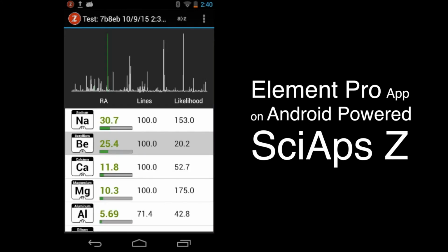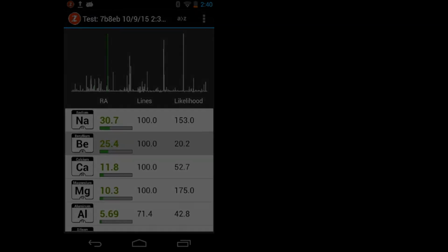So Element Pro is a great way to screen your samples and get an idea of what elements may exist. It's also a great starting point. If you have a new sample that you're wondering if you can measure with LIBS, you test it in Element Pro and you can confirm the elements you want to measure are there. Then you can go and use our Profile Builder PC software to build a calibration for it. And finally, you can get quantitative results out after the calibration is applied to the instrument.